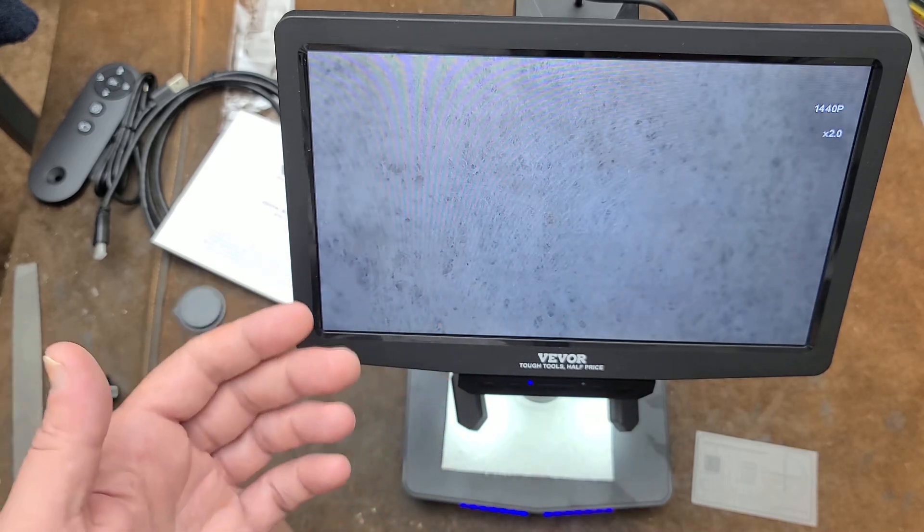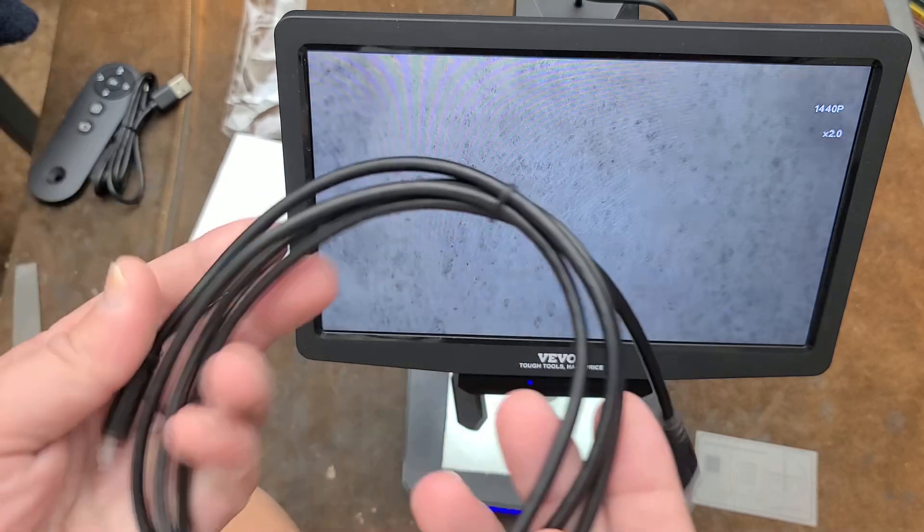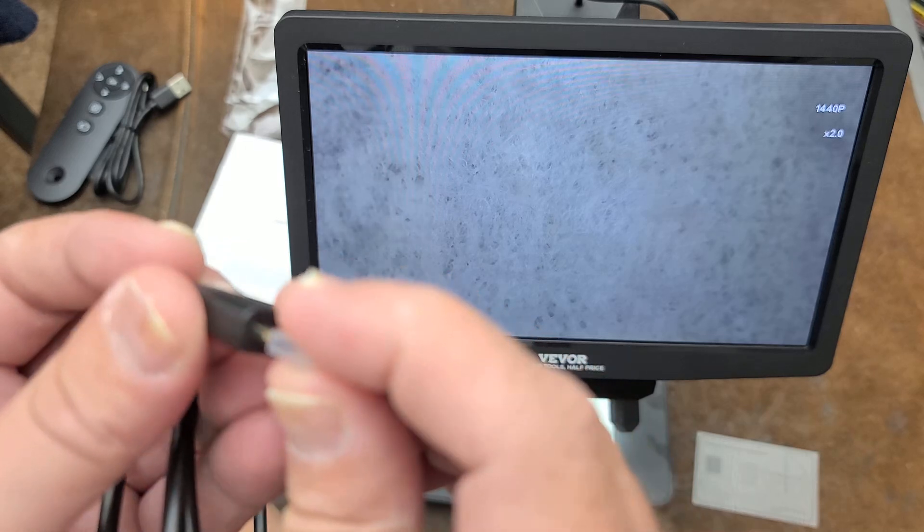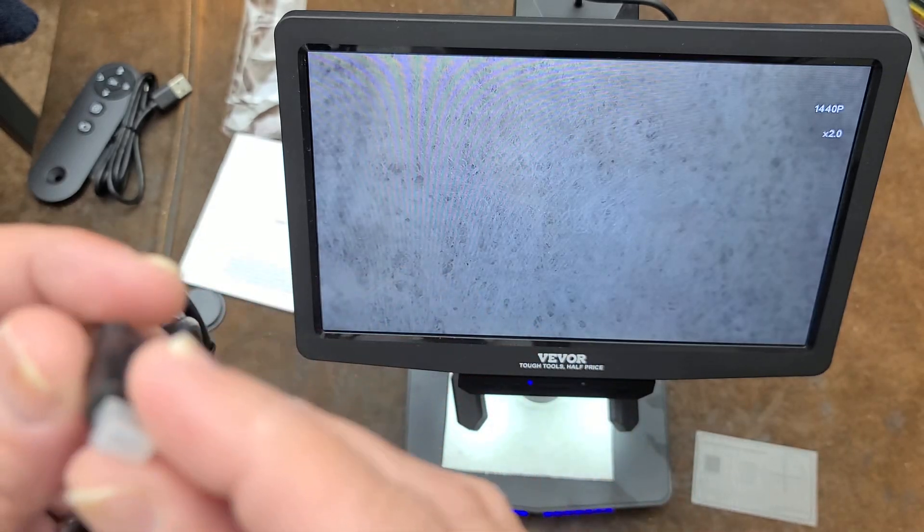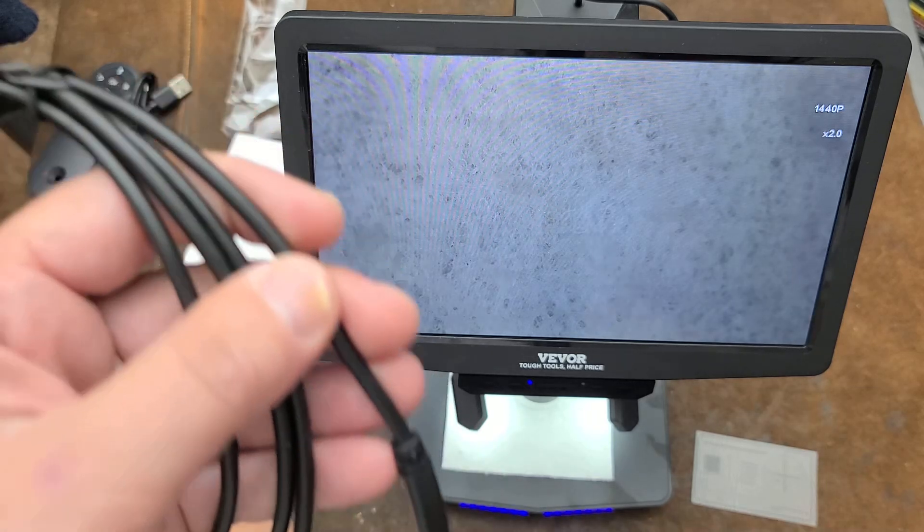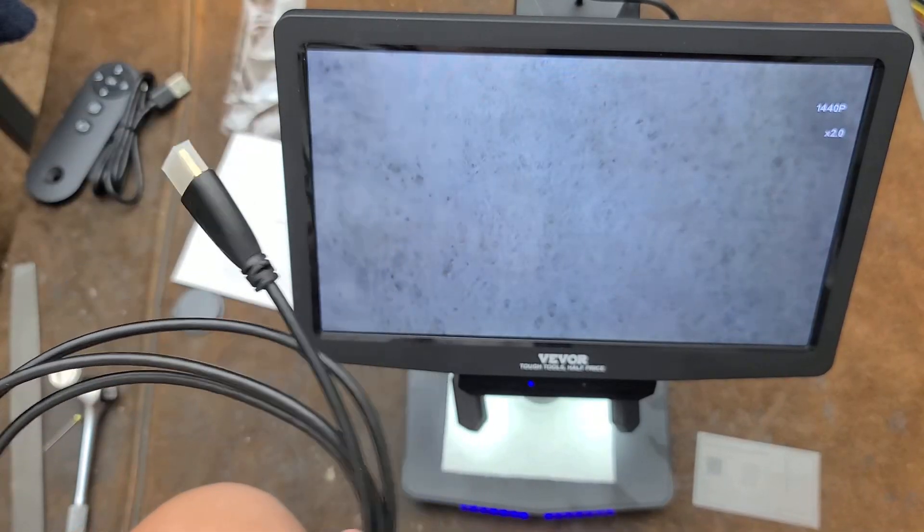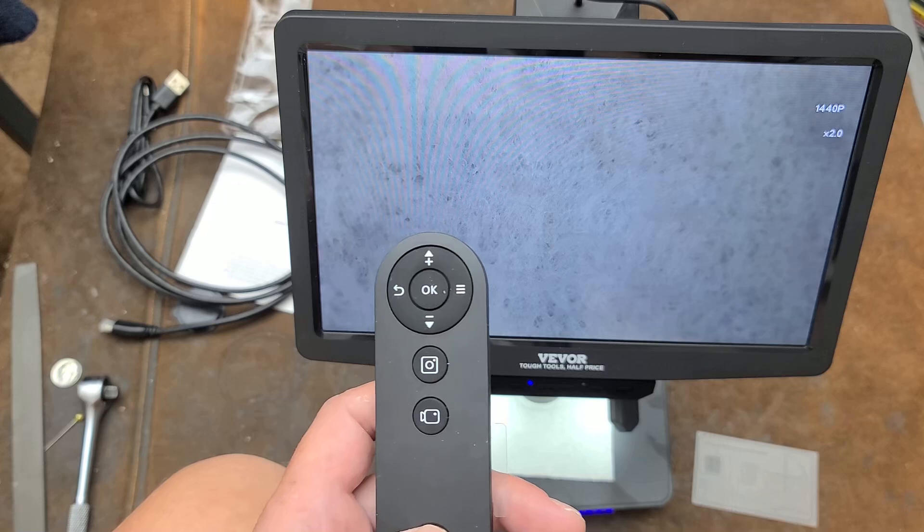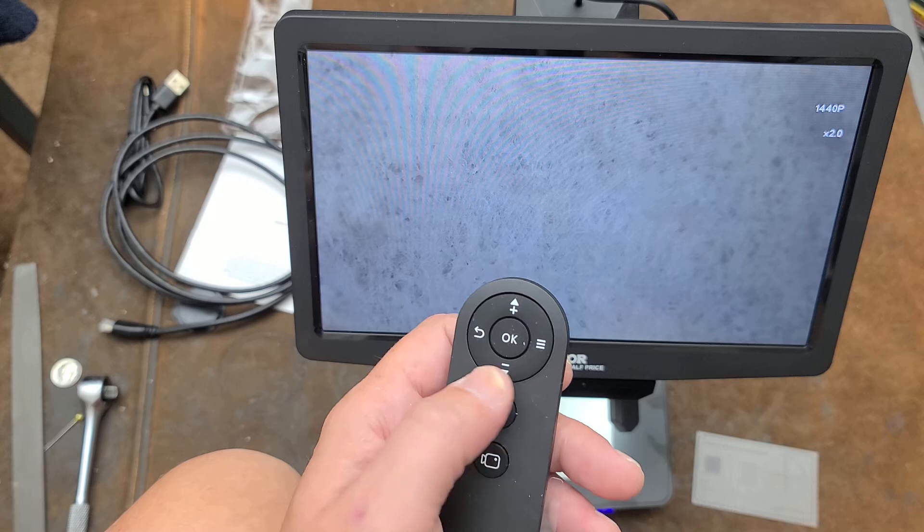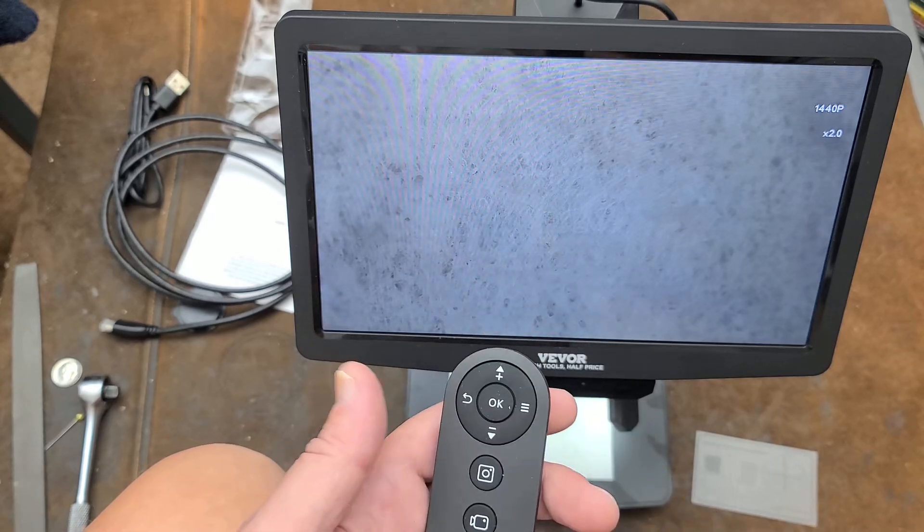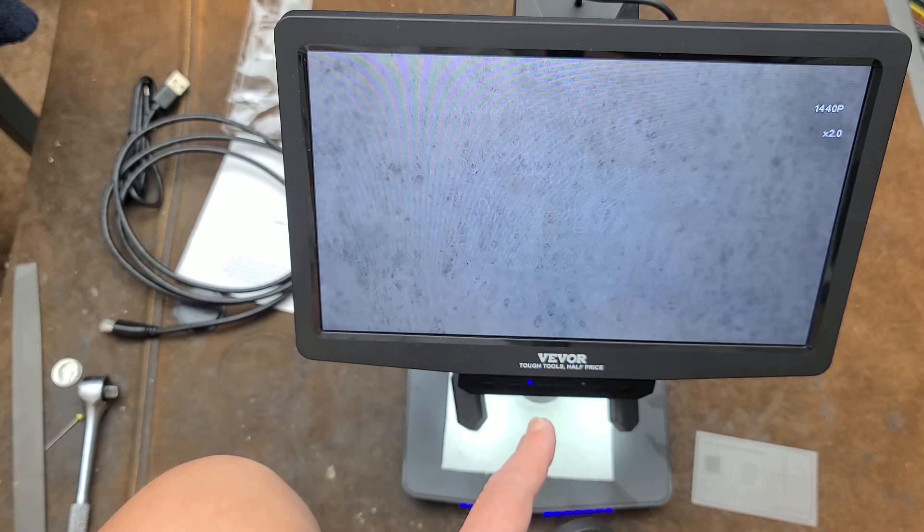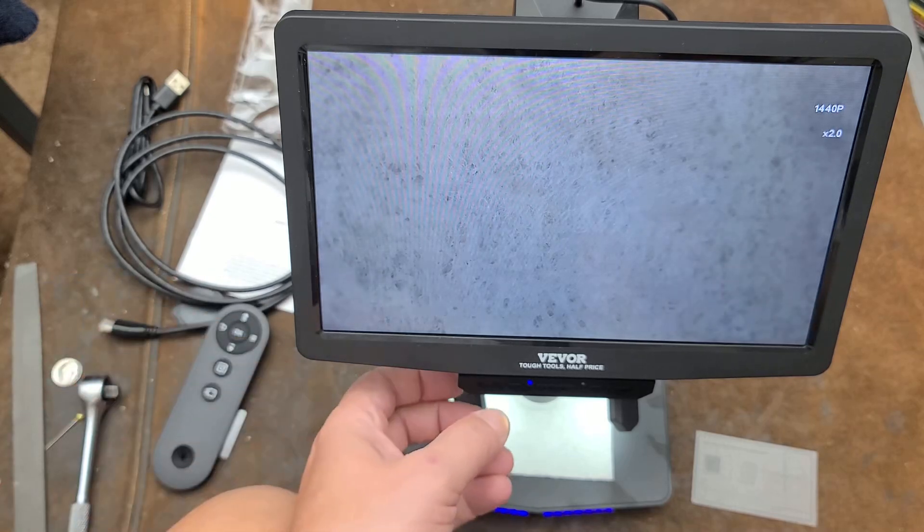It has a built-in battery that lasts a couple hours, which just makes it convenient. Otherwise you just plug it into USB-C. It has an option to use a micro HDMI, so you can plug this into a monitor or a video capture card or like a TV, which is kind of convenient. Also has a remote control. It just has a repeat of the same buttons that you have on the front control panel, except for this actually has a back button where the front control panel doesn't. 1440p video, 48 megapixel photos.